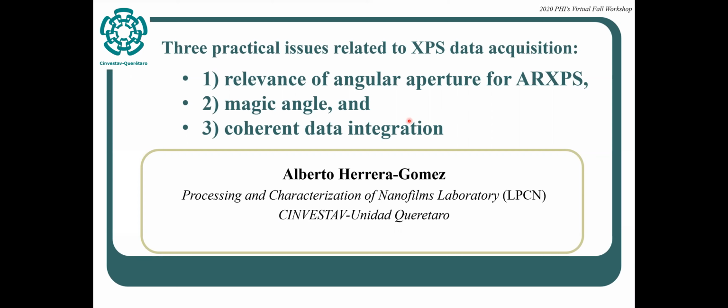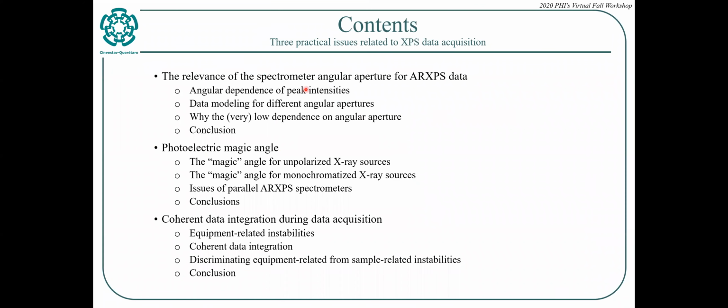I'm going to talk to you about three issues that are relevant for data taking and equipment of X-ray photoelectron spectroscopy. I'm Alberto Herrera from CINVESTAV-Queretaro in Mexico. So this is the contents of the talk.